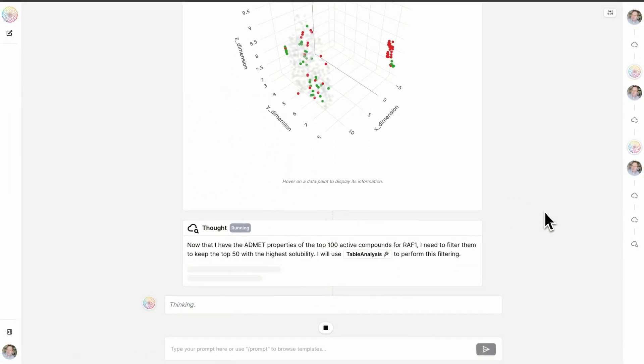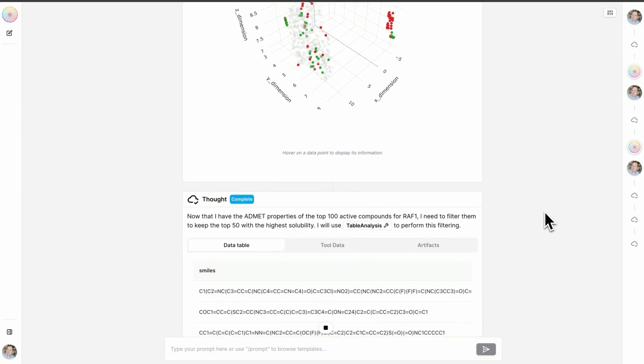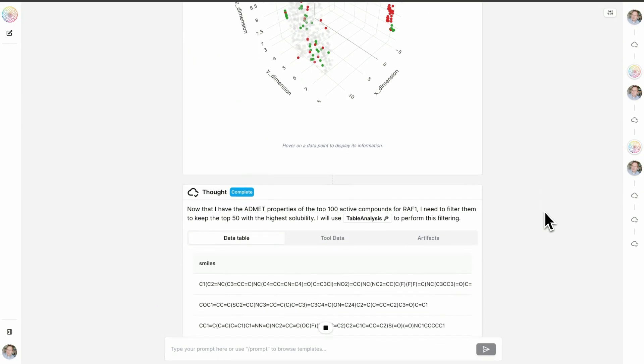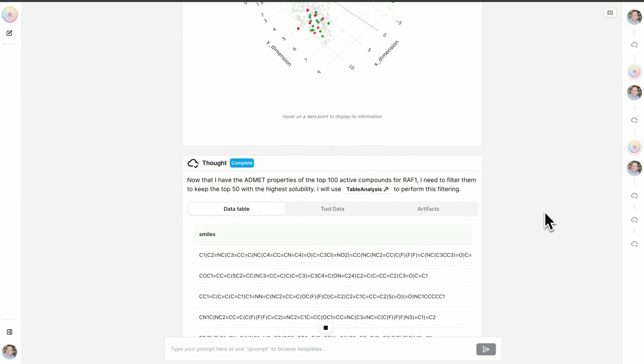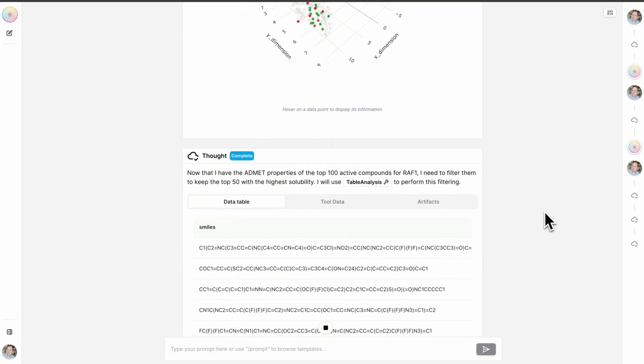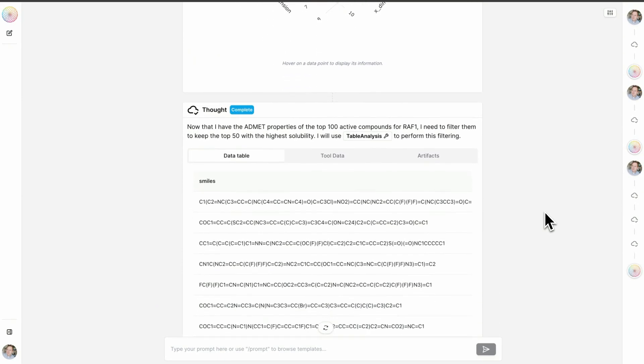Now that we have the ADMET properties of the top 100 active compounds for RAF1, we're going to filter them by solubility, keeping only those with the highest solubility.